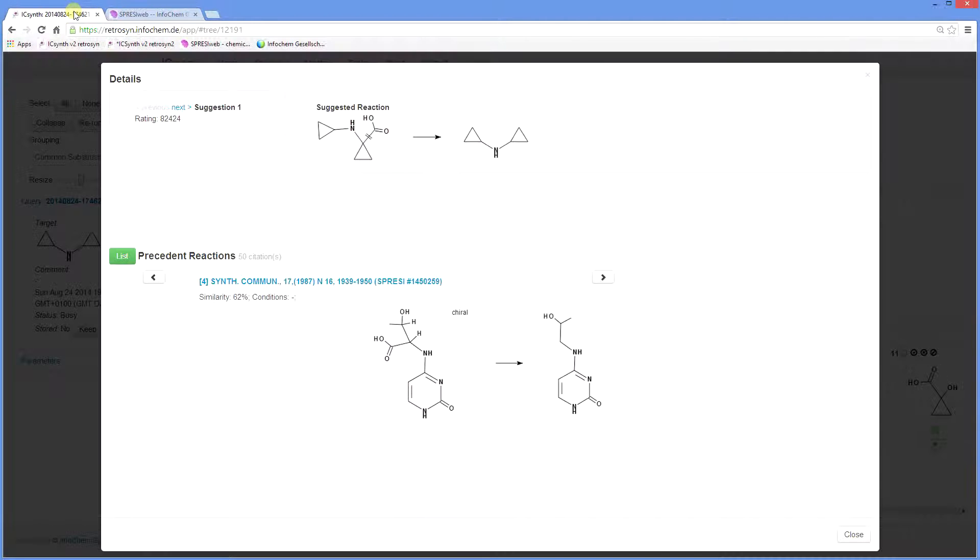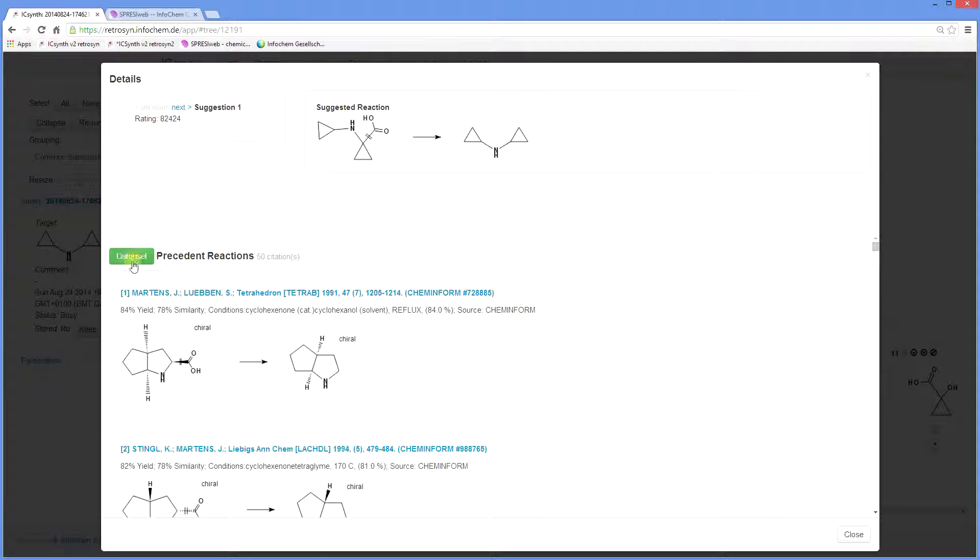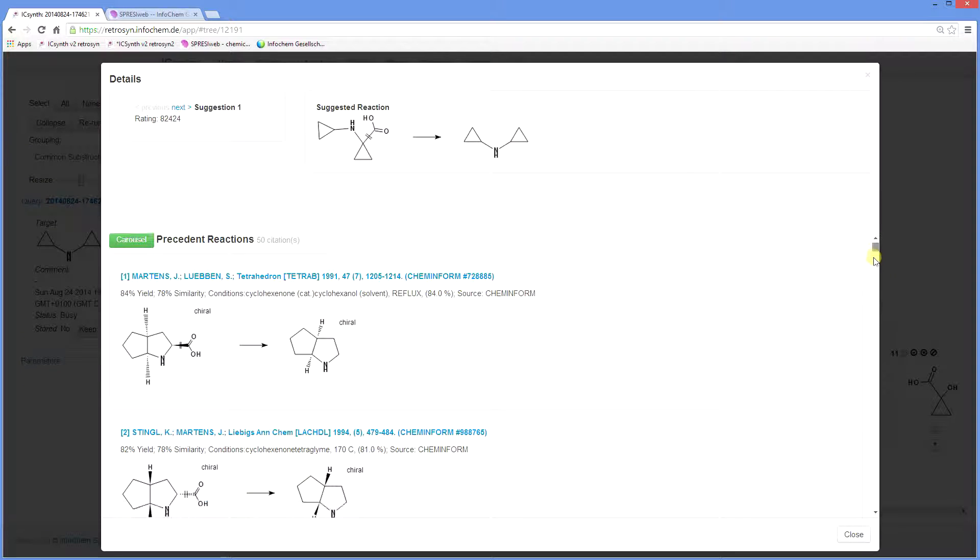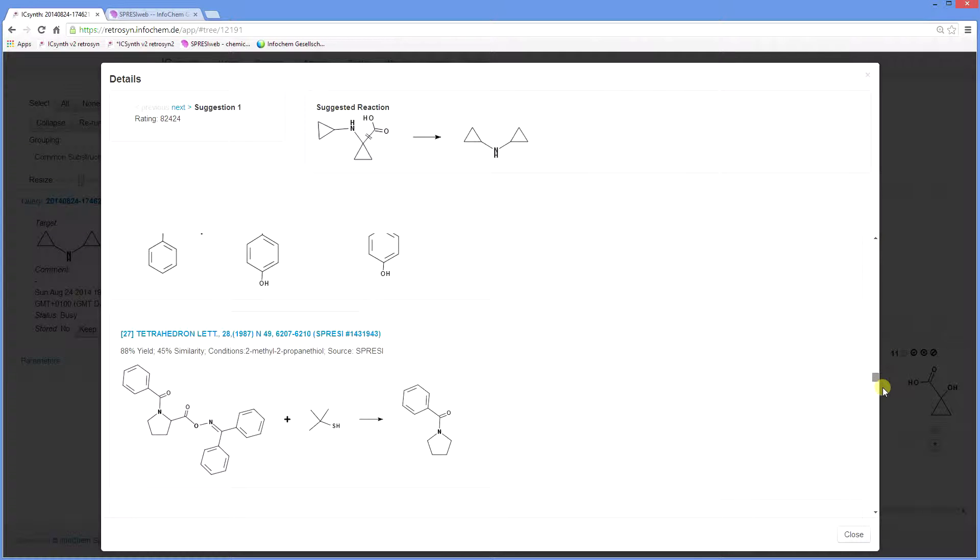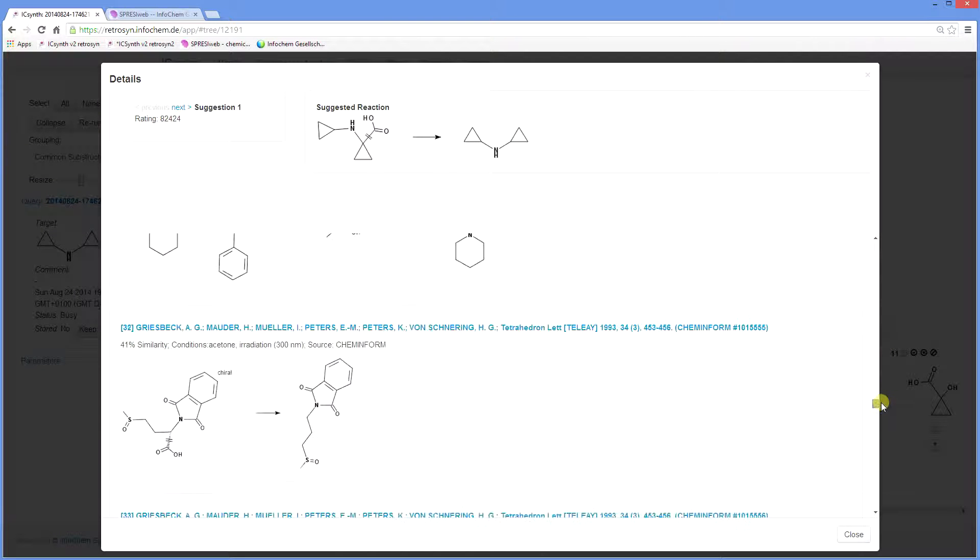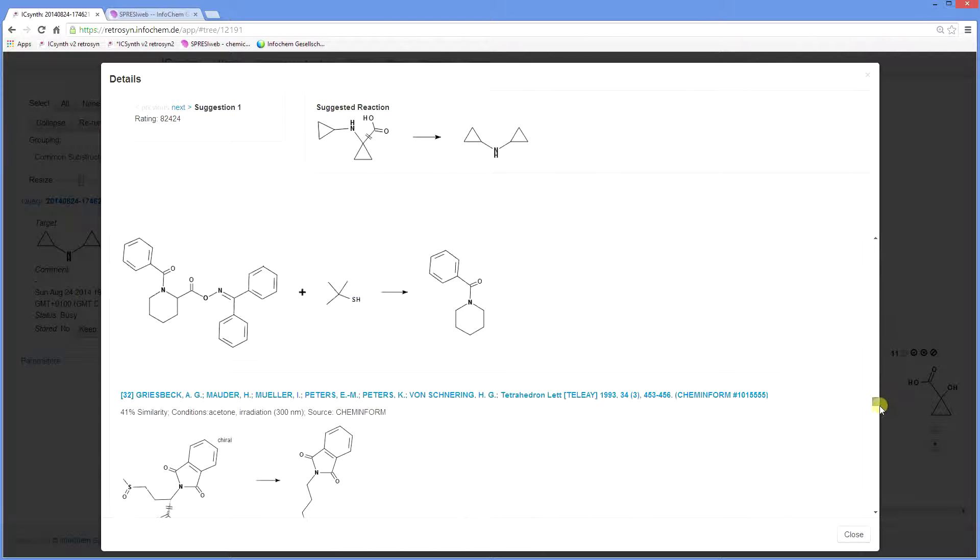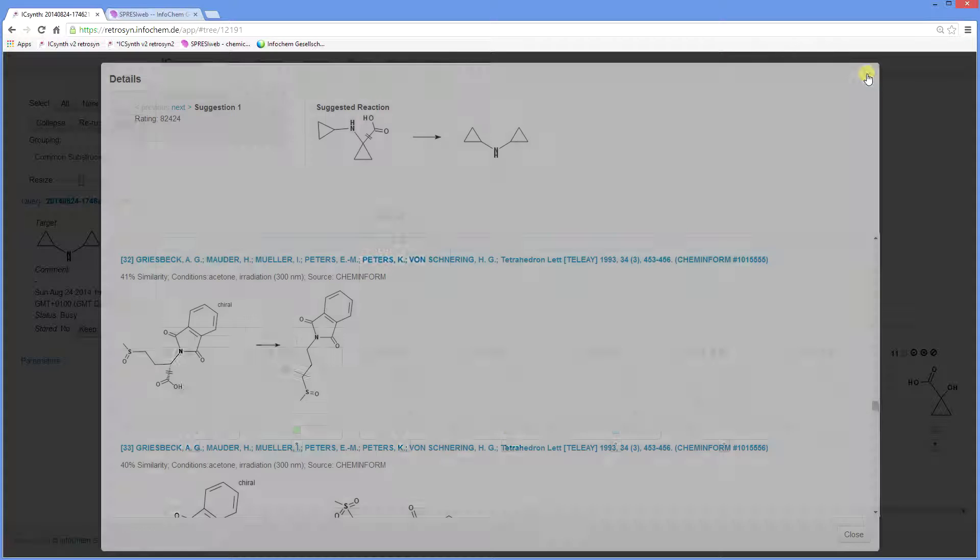You can now view the reaction details in Spresi and link to the journal publisher website to view the full article if you have the appropriate licence agreement. Returning to the reaction window, you can switch between carousel view and list view. This enables you to scroll up and down the list. Returning to the tree display, you see that some nodes contain coloured squares.